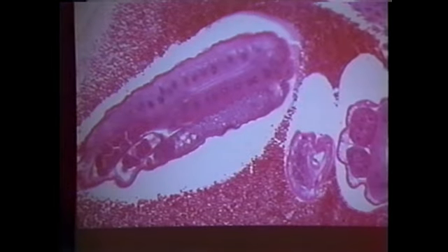Sometimes sections of the male will have chitinized structures, which are the spicules. They're a holdfast organ used during copulation. And here we go, this is the tip of a male, so you can see that in tissue section.